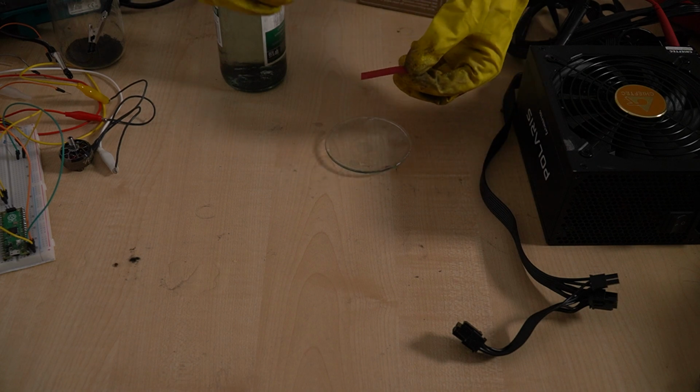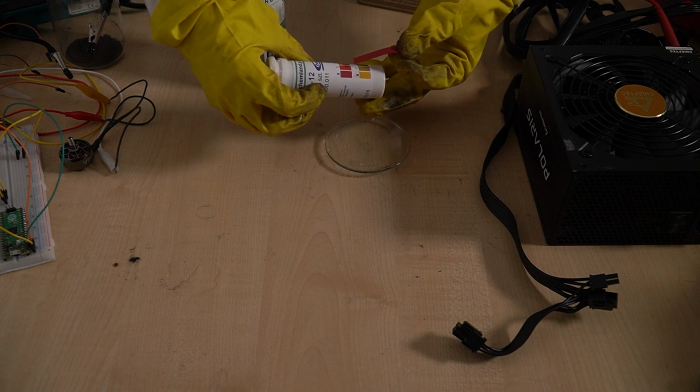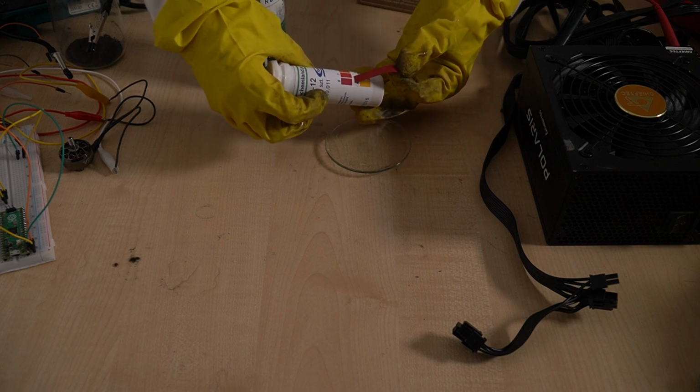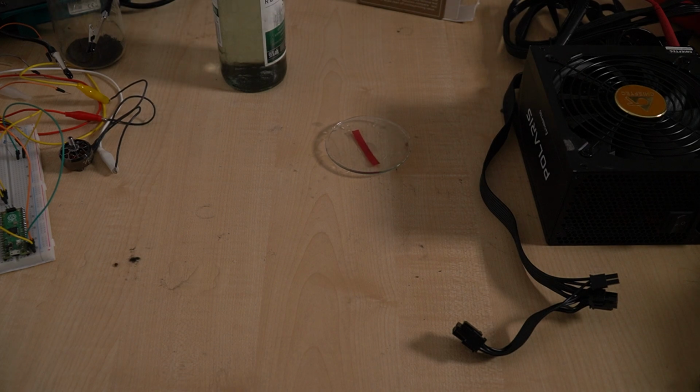You can see the, oh my goodness, that is either a 0 or a 1. It's hard to tell. I feel like it's near 0. I was honestly expecting it to be like a 3 or a 4. I know it's sulfuric acid, but I don't trust myself with making sulfuric acid. I honestly thought it was going to be a 3 or a 4. I wasn't expecting a 0. That's about as good as you can get. You can't really get better than 0.